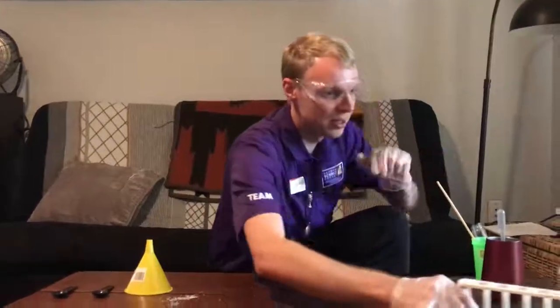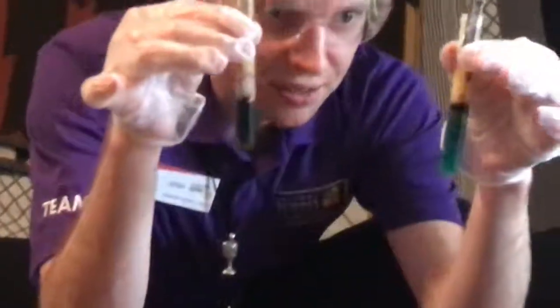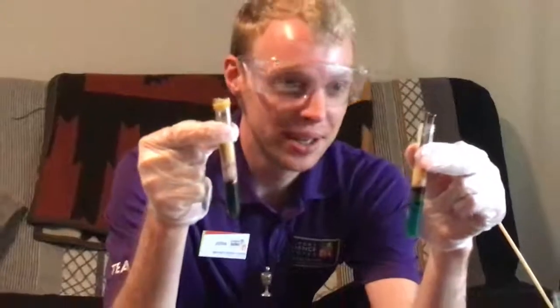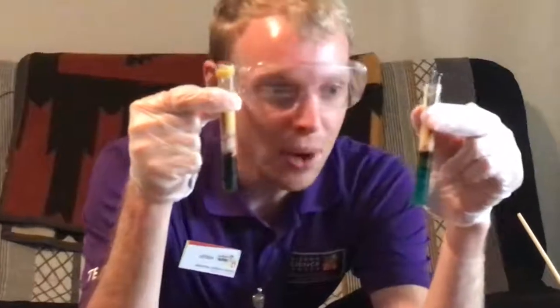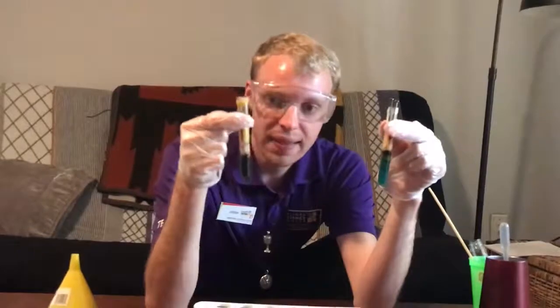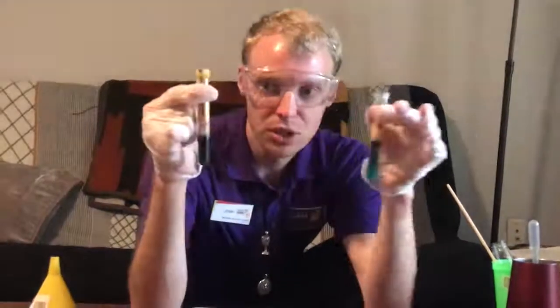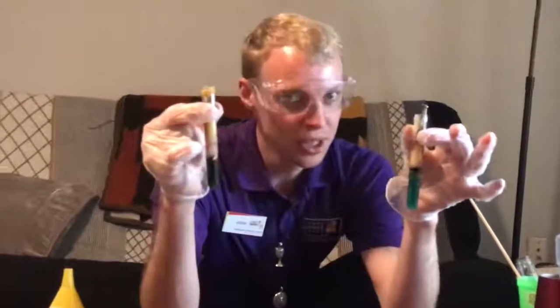And if you want to zoom in, I'm going to hold both of these up, and you can see the different layers. So in both of these, right, similarities and differences. Believe it or not, I made these at the same time, but one of these I didn't put quite enough water, and one of them I moved the nails around too much, which is why you do multiple trials. But if you look on both, you can see the blue. That was what the copper sulfate was initially. And then you see some murky stuff as you hit the first cotton barrier. And then you can still see in both, there is a white layer. That was our salt, or our sodium chloride. And then all of this kind of gross looking orange stuff.